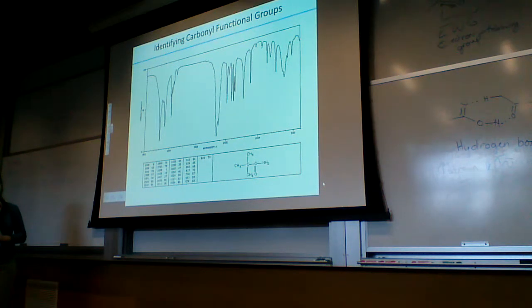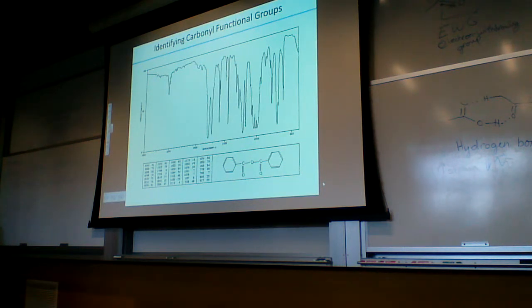For the anhydride, we look for two peaks in the carbonyls because there are two, and they can do symmetric or asymmetric stretching. For an aldehyde, you look for the CH of an aldehyde. Am I missing any? Acid chloride. You hope you can see the Cl. But you also look at where it is in the spectrum.